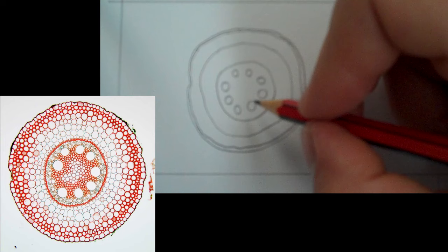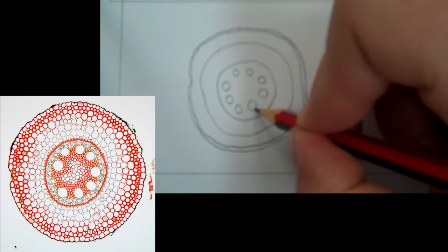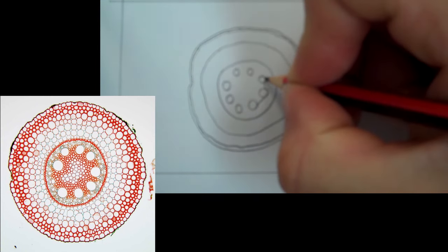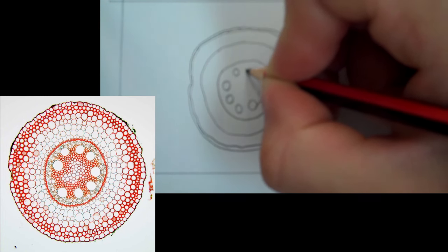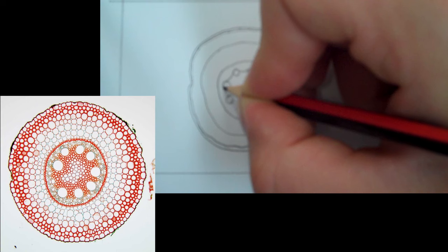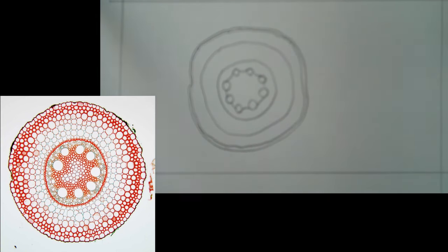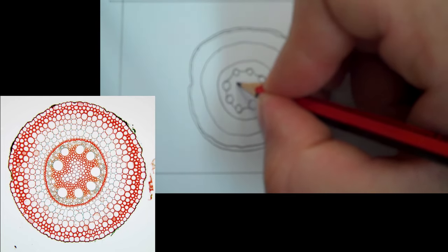And then we can see there's again a difference in staining between the outer tissue there and the inner one. So just following the edge of these. Okay, and then in the middle again the cells are a little different, so we might just try and indicate that.